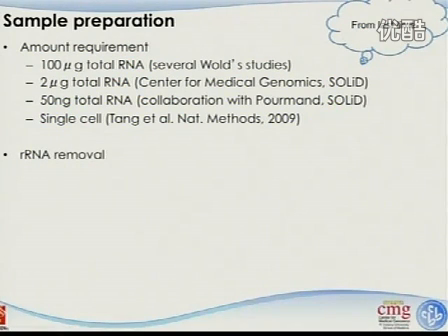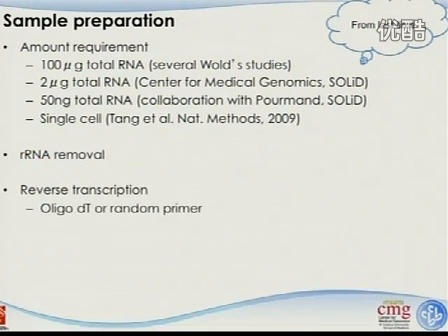And we mentioned the importance of ribosome removal because 95% of the total RNA are ribosome genes, and we don't need those. We don't need to know their expression levels. And so there's a significant need to remove those. Otherwise, 95% of our reads go to ribosome, which we don't want to see.